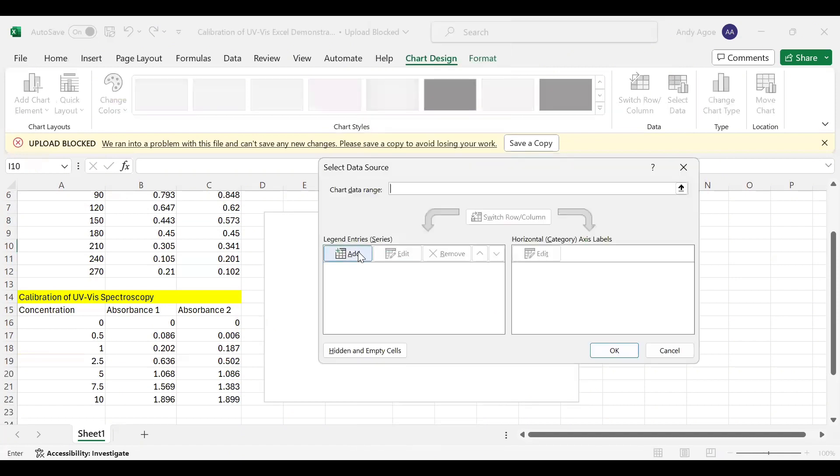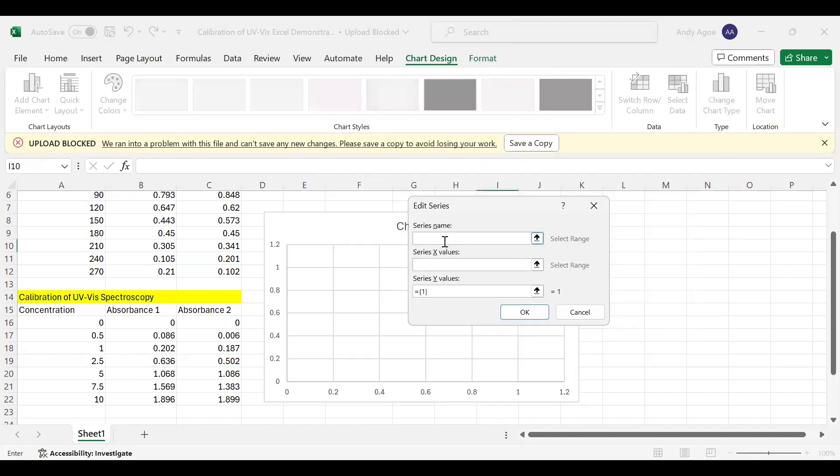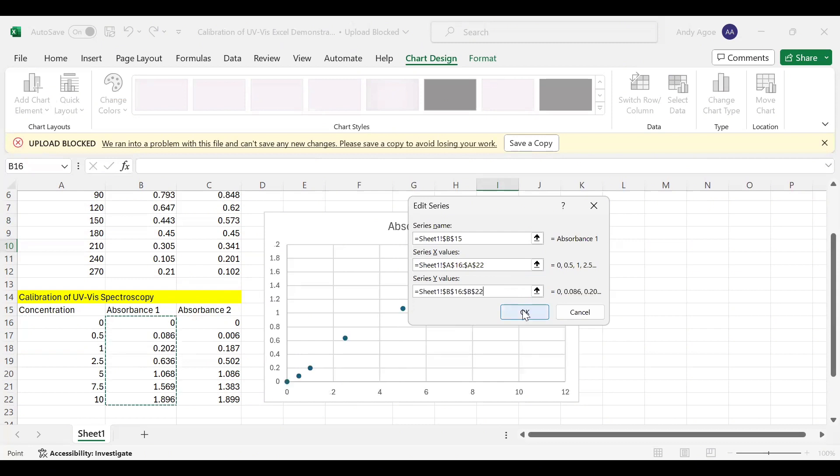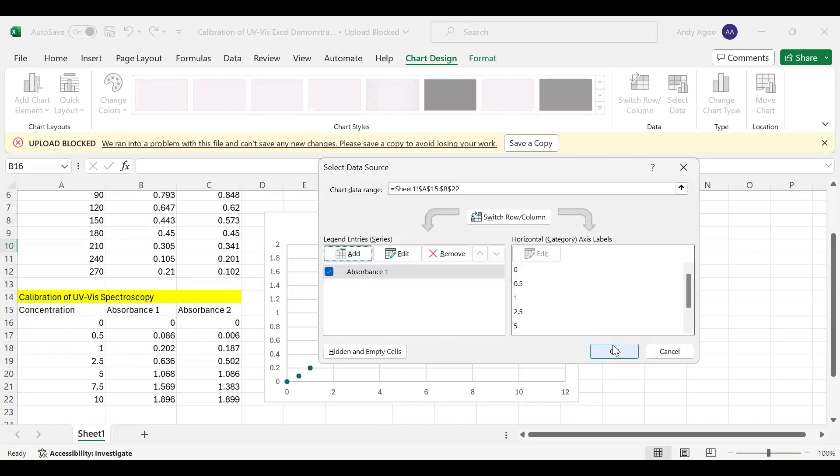Go to Add, then you see the series name. So we select Absorbance 1. What will be our X value? Our X value is the concentration, then our Y value is this one, then we press okay.